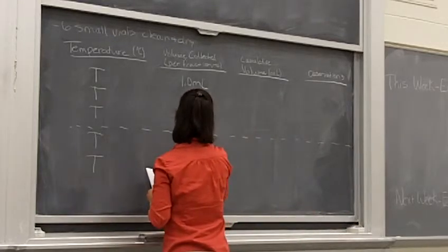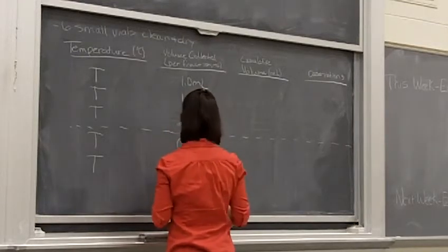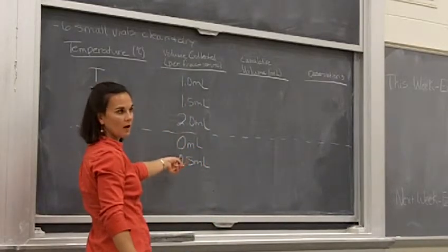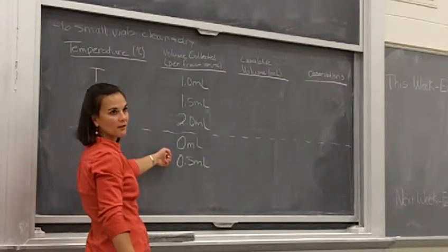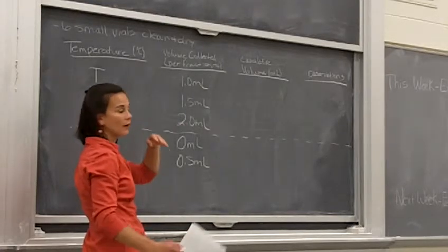So we take this temperature reading, nothing's been collected. Then we have another half a milliliter is collected, and we take that temperature reading. So every time you switch fractions, you're going to start this column over, okay? This is going to be the volume for each particular fraction. So you're going to read what that volume is in the graduated cylinder that you are collecting, right?